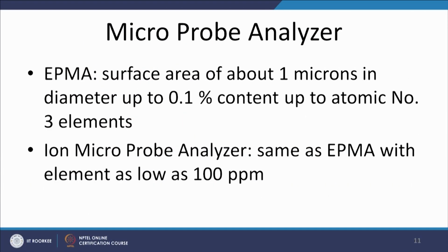Then among other spectroscopy methods, X-ray diffraction based spectroscopy is primarily used for crystalline materials, and X-ray fluorescence spectroscopy is used for both crystalline as well as amorphous materials, and can be applied to solids, liquids and gases. Then infrared or ultraviolet spectroscopy can be used for determining the composition of organic compounds such as oil, grease, rubber and plastics.